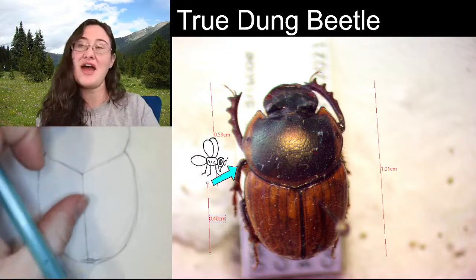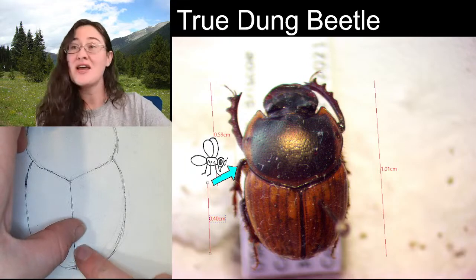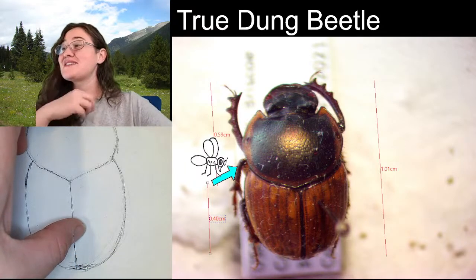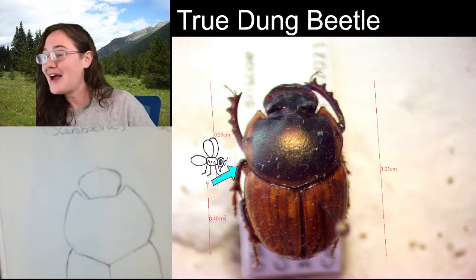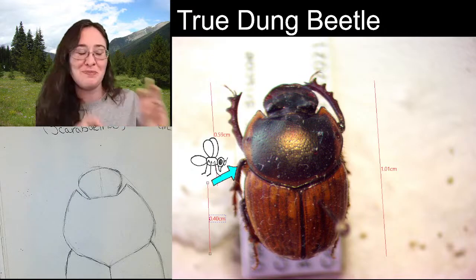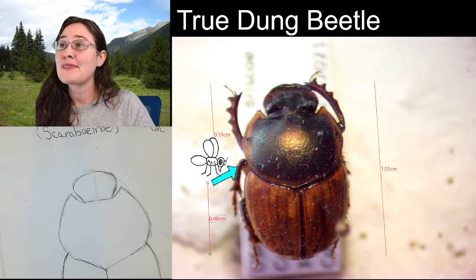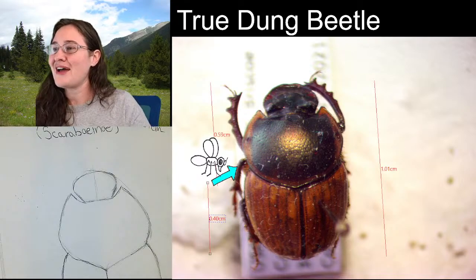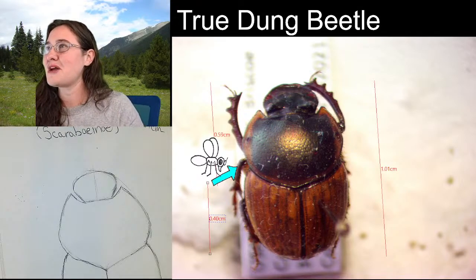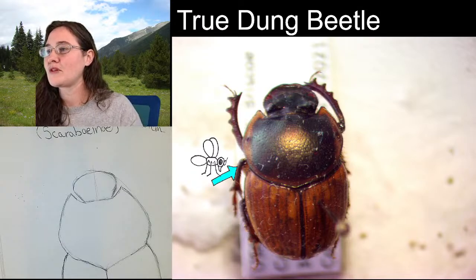We have our head. Our thorax is actually this whole section and then two more segments. The abdomen on this dung beetle is incredibly tiny. I'm excited to show you because the segments are like doop, doop, doop, doop. A lot thinner than normal specimens. Now, let me go ahead and get those measurements off our screen here. All right.